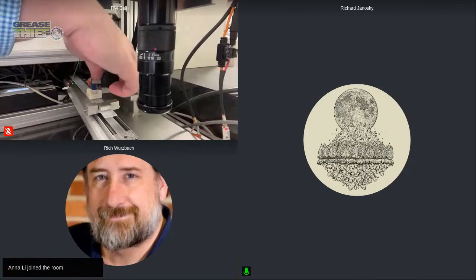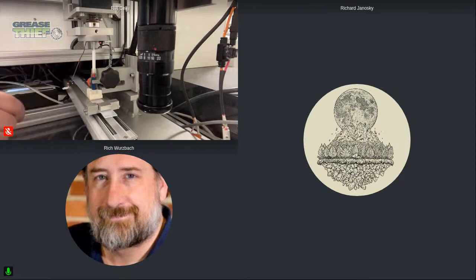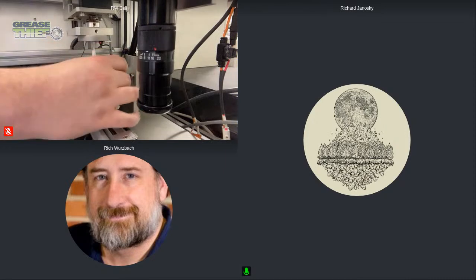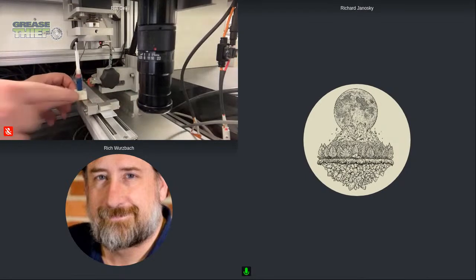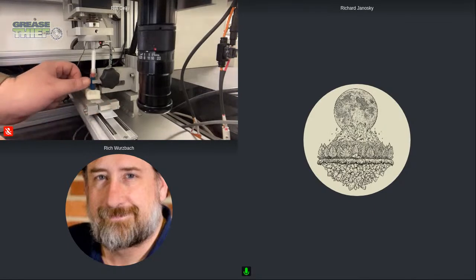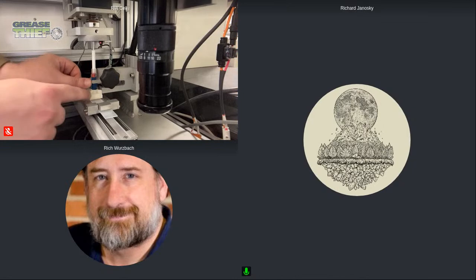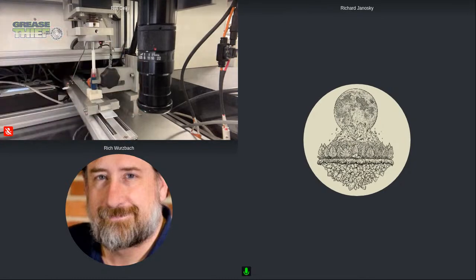And then talk a little bit about the orientation of the die. Yeah, there you go. And also what the purpose is of pressing that in place when you tighten the knob. Yes, so I'll move it out of the way for a second. At the back, you can see there's a flat block. So when you press, the extrusion die is sitting flush against that block. That way you know that you're locking each sample, and each sample is run in the same position, and there's not any angle or any kind of weird obstruction that could affect the results that we're collecting.